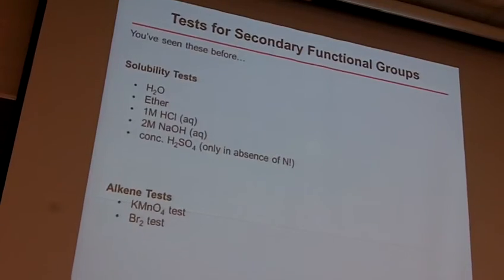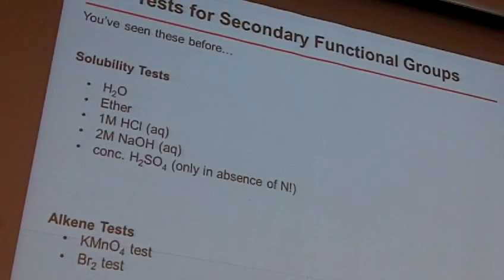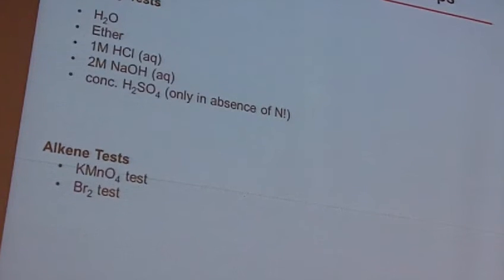Now you have to decide, do you have any secondary functional groups present? Some of these, you've all seen before. The solubility test, like I just mentioned. The standard rundown is there in experiment 6. You can look at that same table, it'll help you out. So we do those. Again, note that only in the absence of nitrogen do you do that sulfuric acid test. I don't have any details here on the alkene test. We can do these two tests to tell for the presence of an alkene: the potassium permanganate and the bromine test.